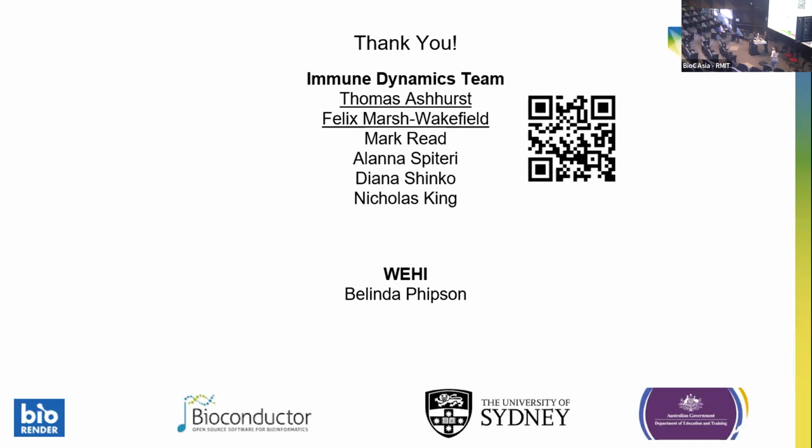Thank you, Givanna. Are there questions? Yeah, there's one from Marie here. Very nice talk. I was a bit curious, how did you come up with the idea of Spectre? I mean, there are a few works like the Catalyst package and diffcyt from Bioconductor, both of which also provide some methods for differential analysis. So, yeah, I'm a bit curious.